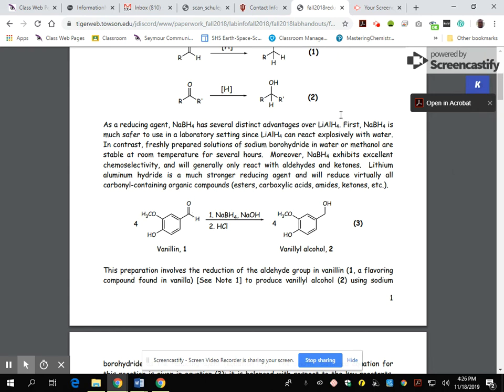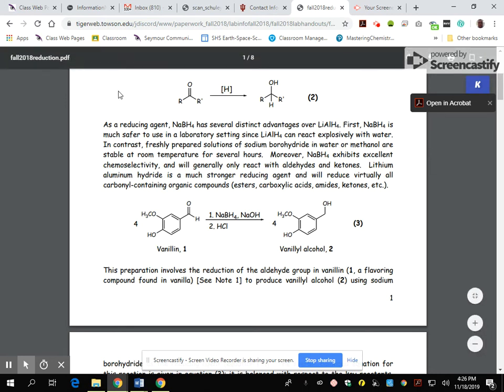If you're looking at this screen right here, you can probably get some reasons why we're going to use a different reducing agent. Number one, we don't have any on the premises. And number two, you can probably see why. So what we're going to do is use a reducing agent called sodium borohydride. And sodium borohydride, you can see, is a molecule with lots of hydrogens in it.